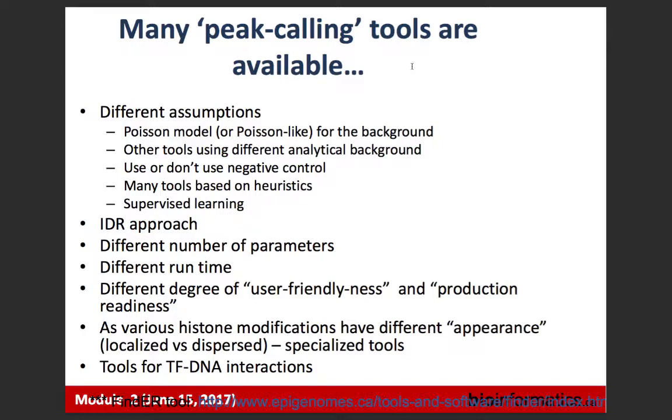First of all, people took a lot of effort to write those tools, and people sincerely found the best heuristics for the data at their hands at this very moment. So in every publication, you would see that my tool performs much better than tool ABC available before. But this was done only on this particular data set, on those set of parameters which were tuned for this particular data set. Unfortunately, that's the way we're doing. We're a little bit overfitting things. Visualize the data, run some tool, visualize the data, see how happy.